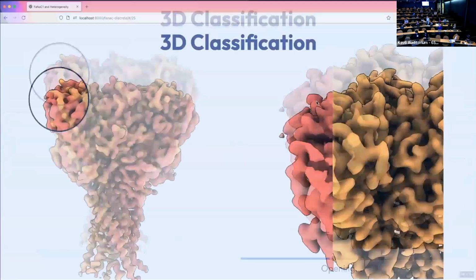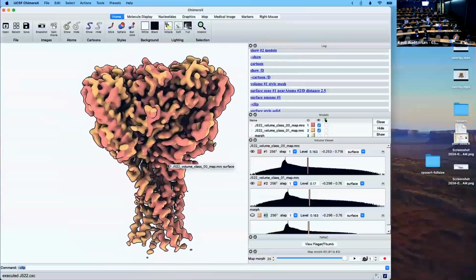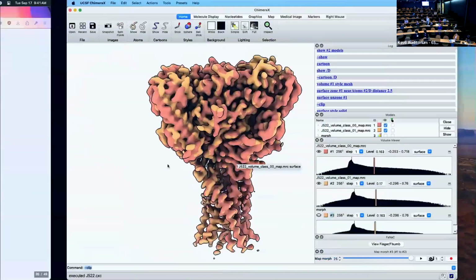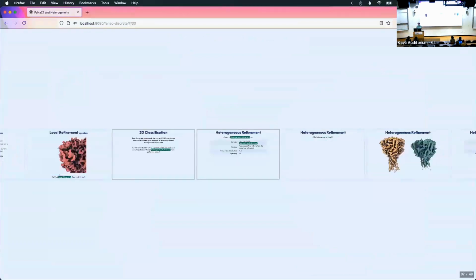And then you already have the transmembrane domain very well resolved. But my question is, after you do the local refinement of your pose state and update the poses, assuming you only have one single global minimum, that updated pose will most likely change the conformation of your transmembrane domain. Is that what you observe? Yes, it is. So your question is basically, once we've separated them out and done the local refinement, do we see the ligand-bound transmembrane domain? Yeah. Yes, we do.